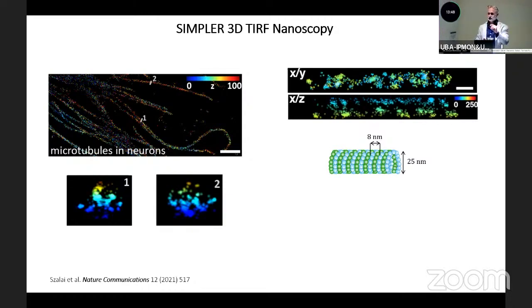Because we have the resolution. In this experiment, we have a resolution of about 8 nanometers, actually. But we don't see it because the labeling density is not high enough. And this is something that happens to all super resolution methods, right? We didn't discuss that yesterday, but one part of the problem is to obtain the resolution or the localization position.